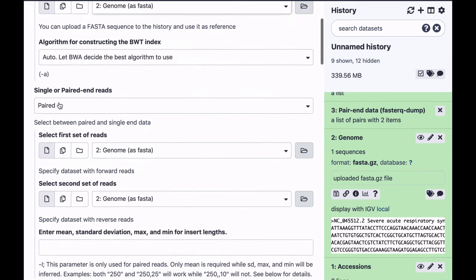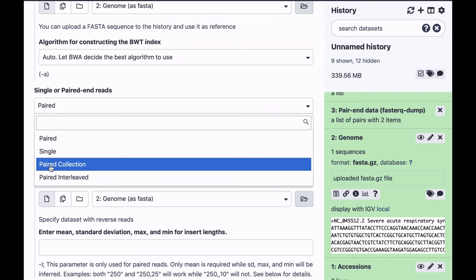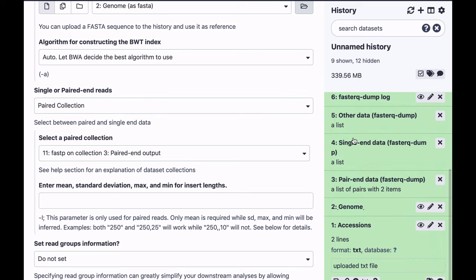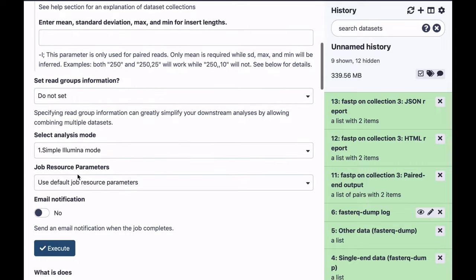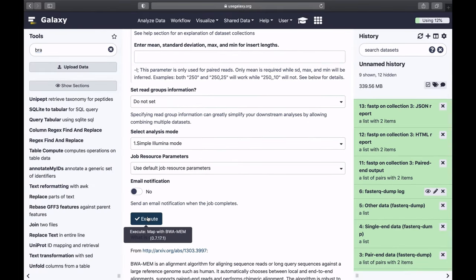And my reads are in the form of a paired collection. The collection I'm going to be using, because I have several collections now—this is the original collection, this is how data was downloaded from SRA. And now it's processed by FastP, so that's the data set I want to use now, this data set number 11 in this case. I'm not going to change any other parameters, I'm just going to start running.